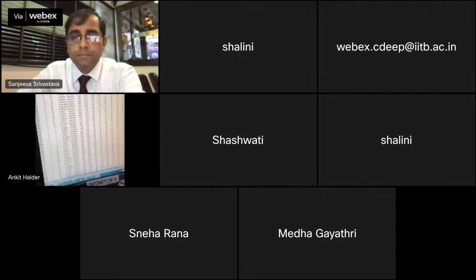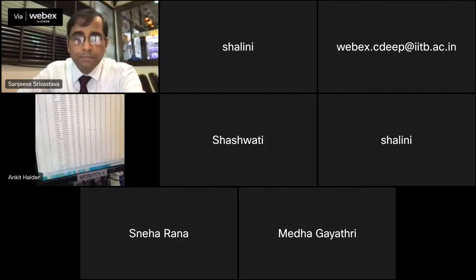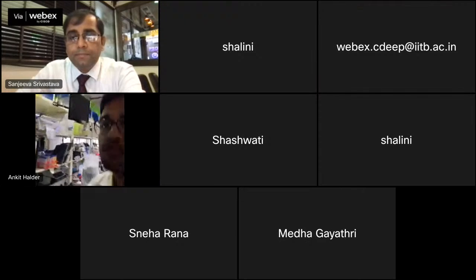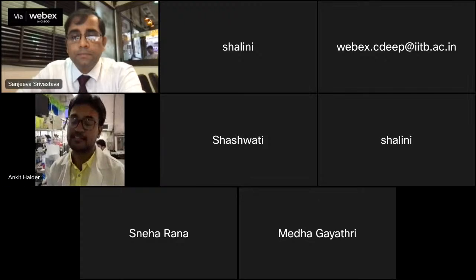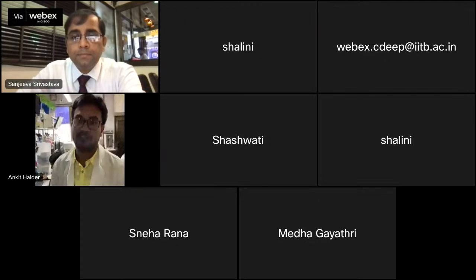All proteins are printed. You can see block-wise there are different blocks, columns, and rows. According to that, you need to know which proteins you want to take and which data you want. Everything is there in the particular GPR file. So this is all about the extraction of the data, and then we take all the data into the R programming language for further statistical analysis, and usually decide which is the significant biomarker for this. So thank you.